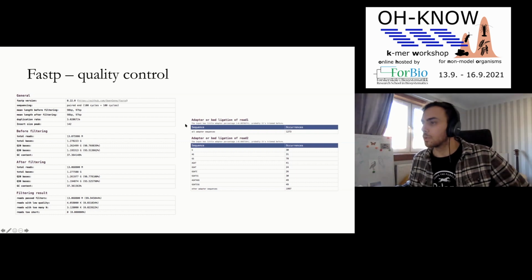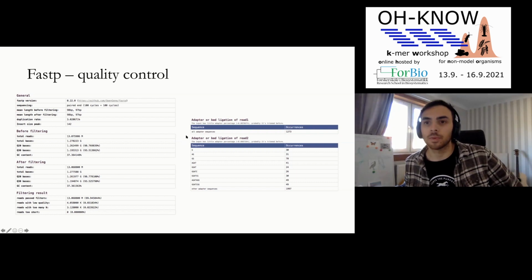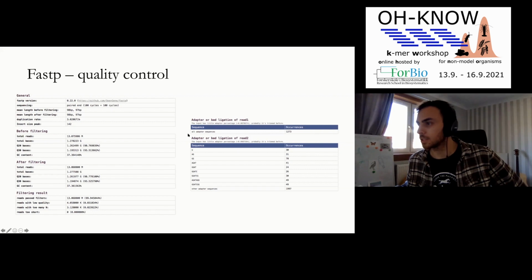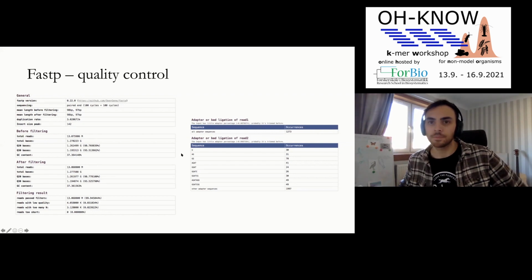It will also tell you, which can be especially useful, if you have any adapter left in your sequences. So some of you might get sequence back from a cluster, a sequencing center or consortium, and you don't actually know what you've been left with. Have they cut off the adapters? Have they demultiplexed for you? And fastp should help you get at all of those questions.